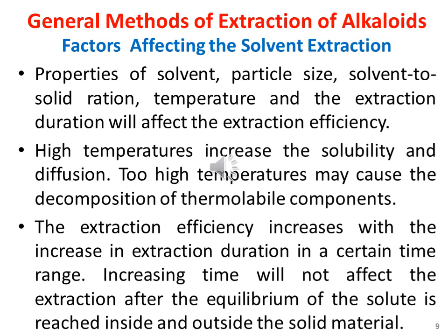High temperature increases the solubility and the diffusion. Too high a temperature, however, may cause the decomposition of the thermolabile components. The extraction efficiency increases with the increase in the extraction duration in a certain time range. Increasing the time beyond this range will not affect the extraction efficiency, since the equilibrium of the solute is reached inside and outside the solid material. So these are the main factors that affect the efficiency of solvent extraction.